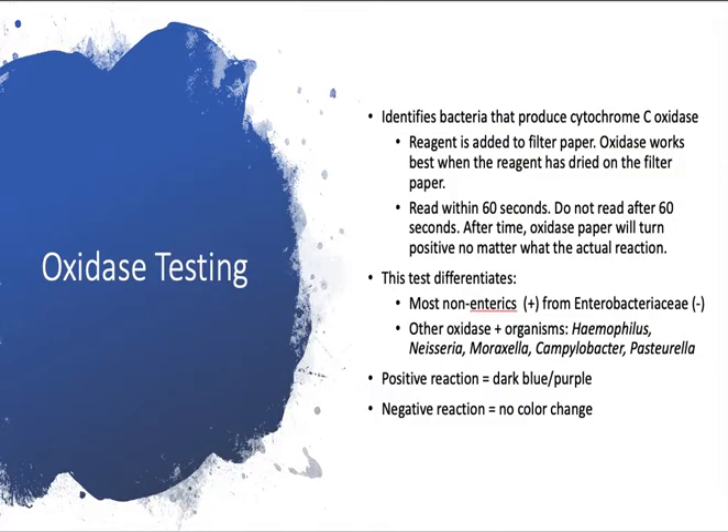The oxidase test identifies bacteria that produce the enzyme cytochrome C oxidase. You have a little ampoule and a little piece of filter paper. The reagent from the ampoule is added to the filter paper. Oxidase works best if the filter paper is allowed to dry with the reagent on it — if you try to use it while it's still wet, you will not get correct results. Make sure your filter paper is dry after you add your reagent.